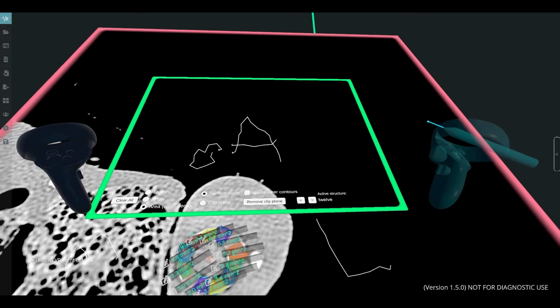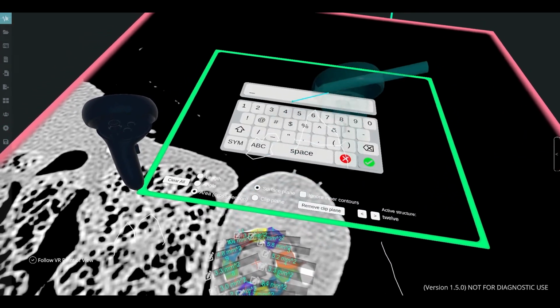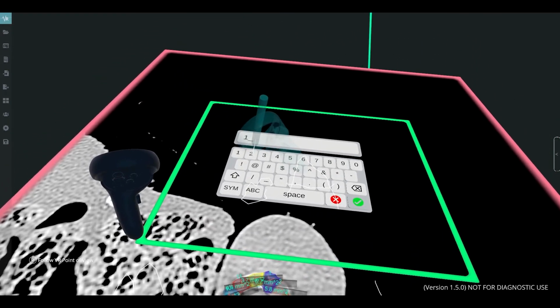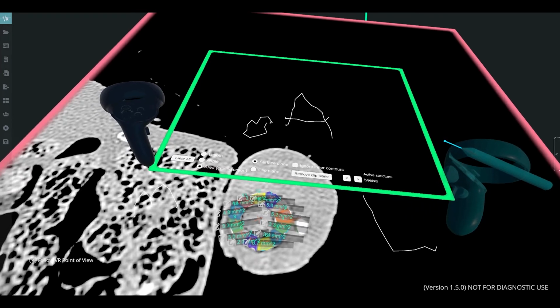Now the other one, so 12 was the remainder, right, of the medial. So I had to flip through several of those models. It wasn't just the next in line. So you really have to watch the label when it says what you are clipping.